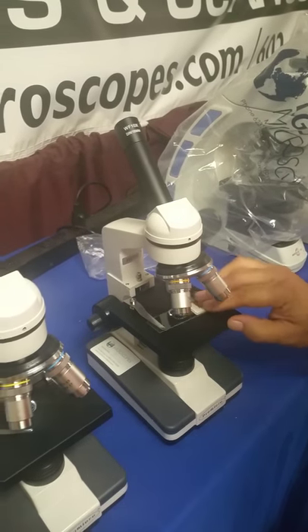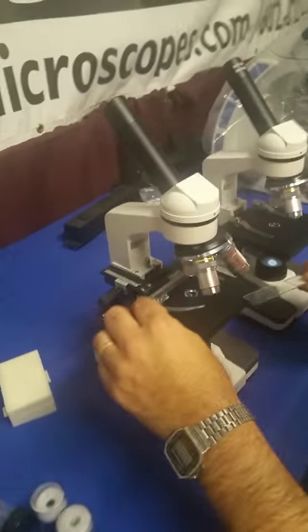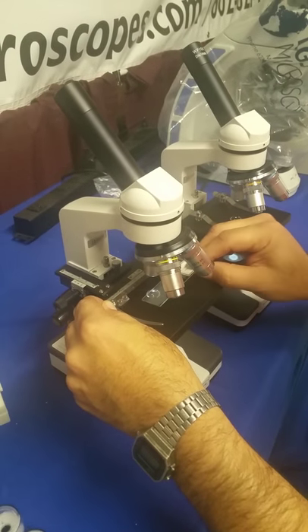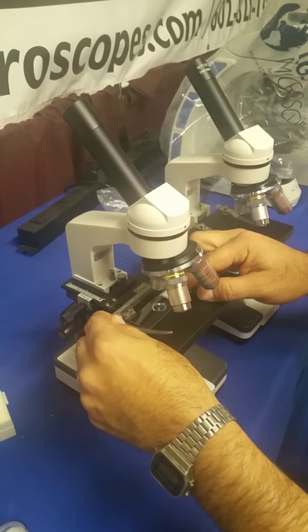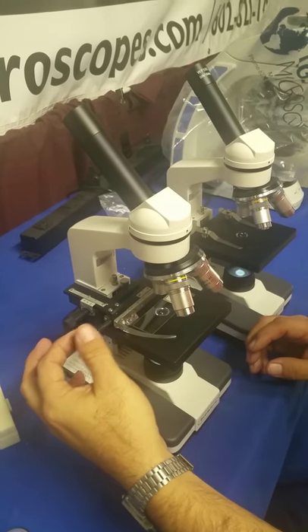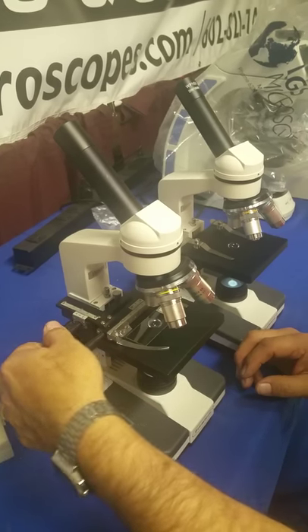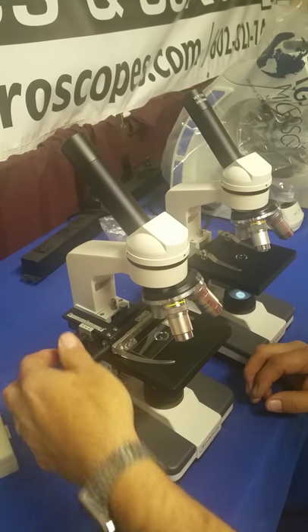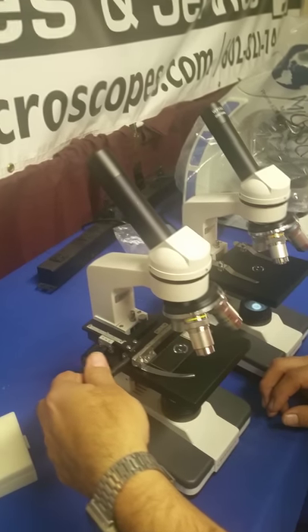We also have a different option with a mechanical stage over here. On this one, you slide the microscope slide into the slide holder. You have independent X and Y controls so that you can precisely locate exactly where you want to go when looking at the slide under the microscope.